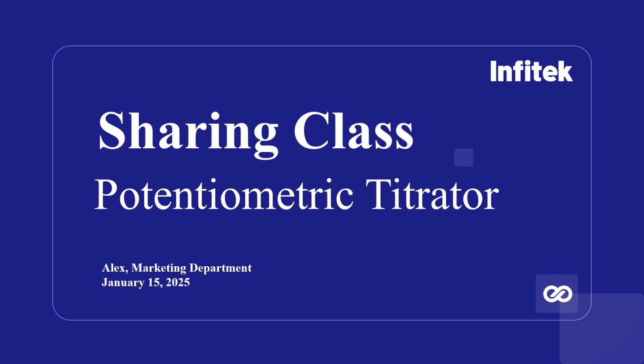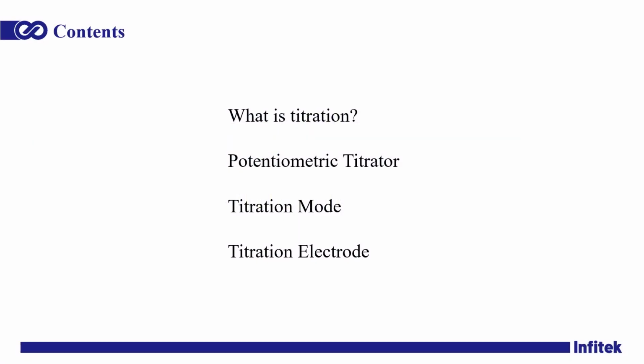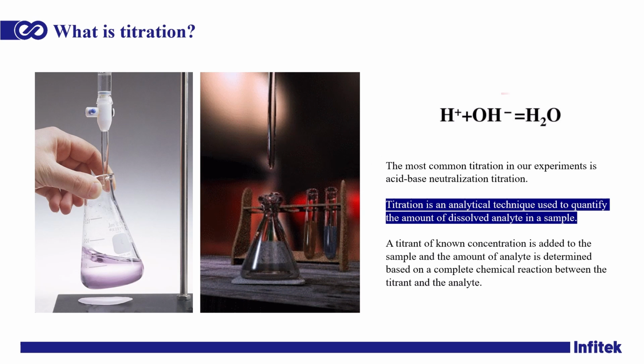Today we are learning about potentiometric titrator. These are the contents we want to share, including 4 parts. The most common titration in our experiments is acid-base neutralization titration.